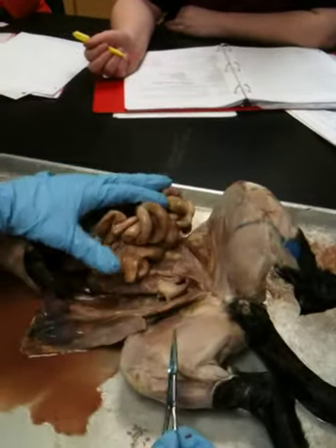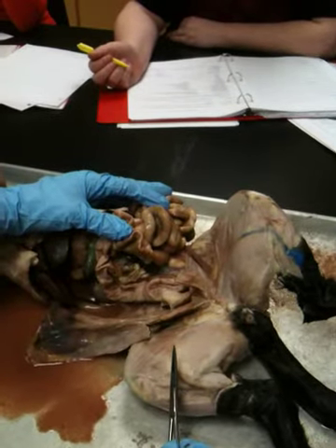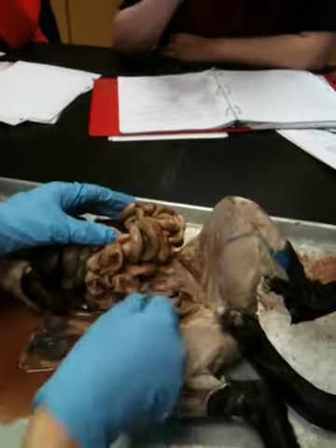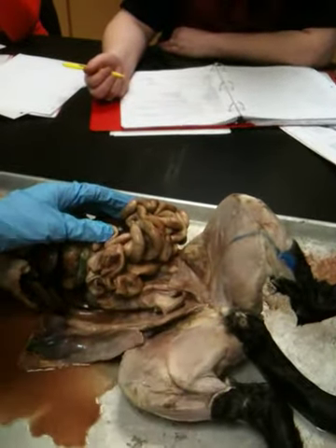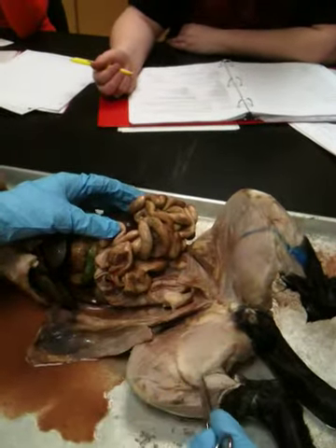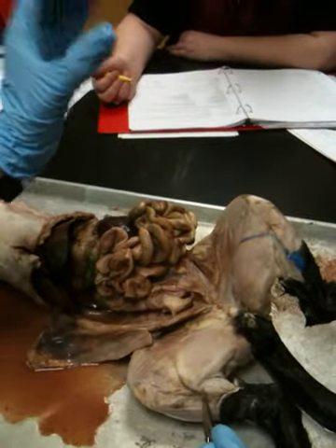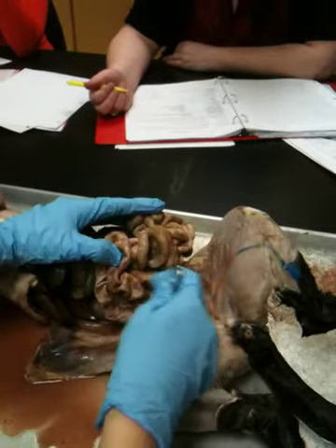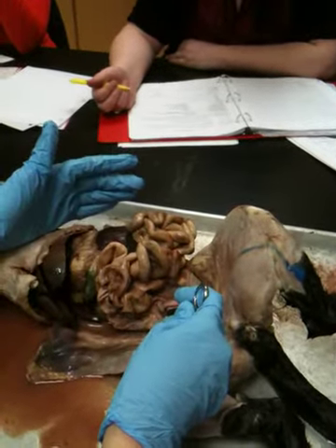And now ours is a little more like that, right? Well, this one is too. I've got them all popped out. It's correct, but it's just theirs goes up in a U, whereas ours goes up and down, and then it makes a zigzag towards the center. Okay. So they have much more of a horseshoe shape, and ours has got more zigzags to it. Okay. So that gives you the intestinal tract.